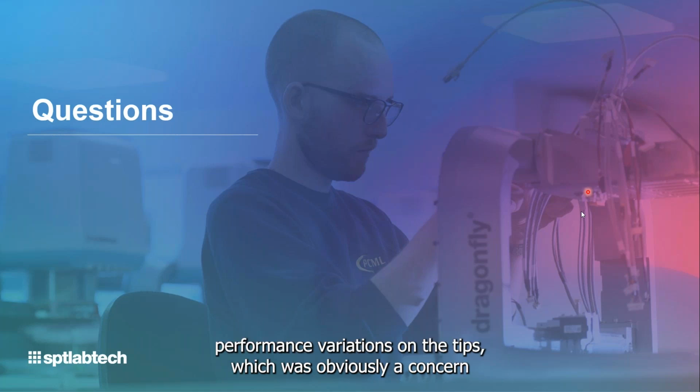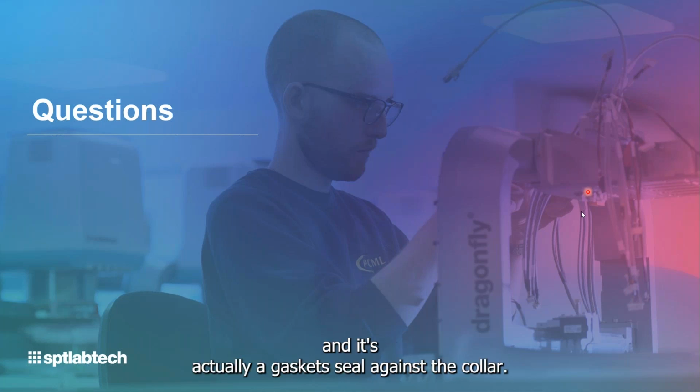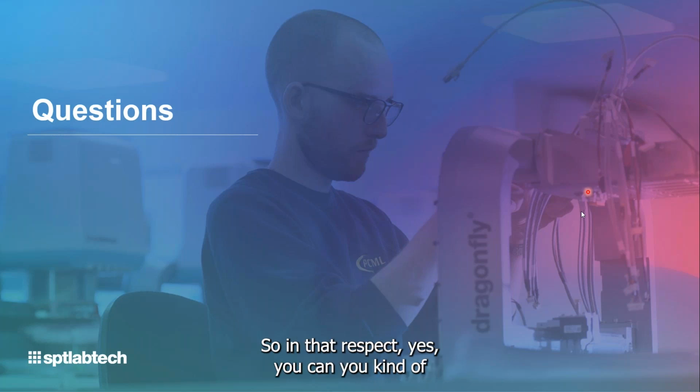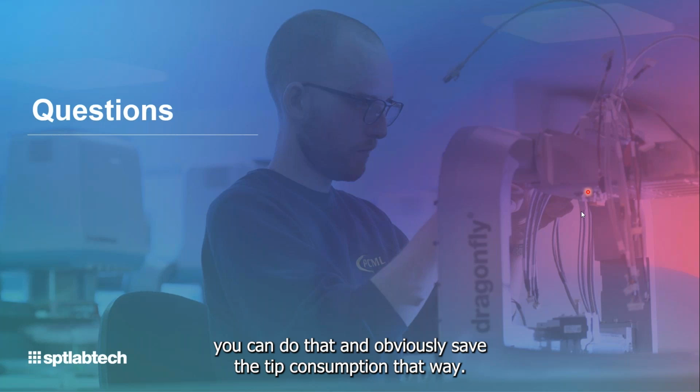The way that the tip loading system works on the Firefly is that the tips are in clusters with a collar, and it's actually a gasket seal against the collar. So there is no deformation of the tip, and you can reload that as many times as you like. It's very low force, and there's no change to the tip seal that you see. So in that respect, yes, you can just keep using a set of tips. Within a protocol, if you're happy at certain stages to revisit the same set of tips, you can do that, and obviously save your tip consumption that way.